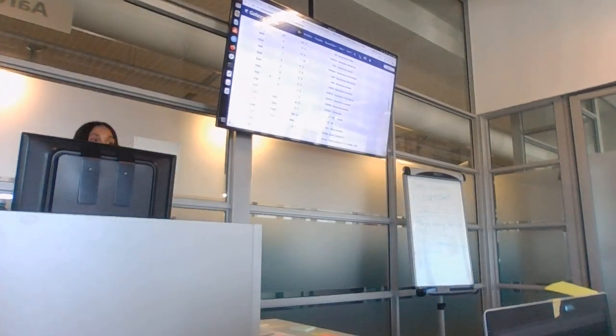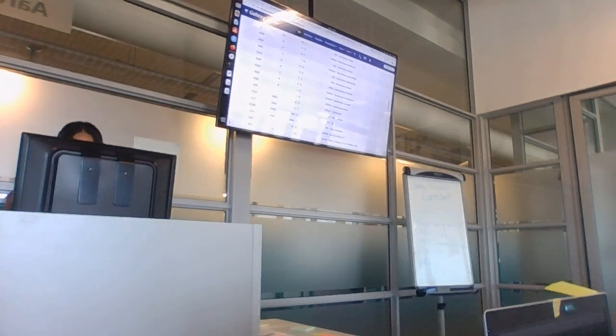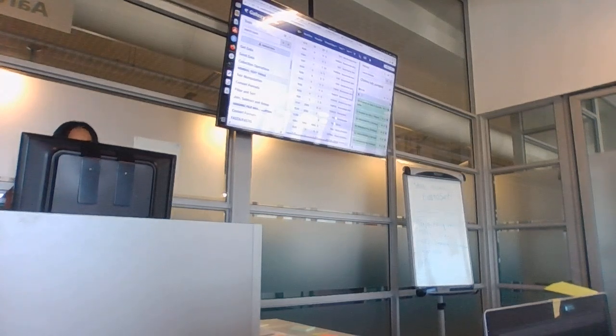So this is an example of, again, you have to do quality assurance. Don't make a fool out of yourself by having your sample become training data, right? Where somebody needs to make an example of your data. So Kraken, don't skip it, it's very useful and it does a nice job of telling you what exactly went wrong. Okay.